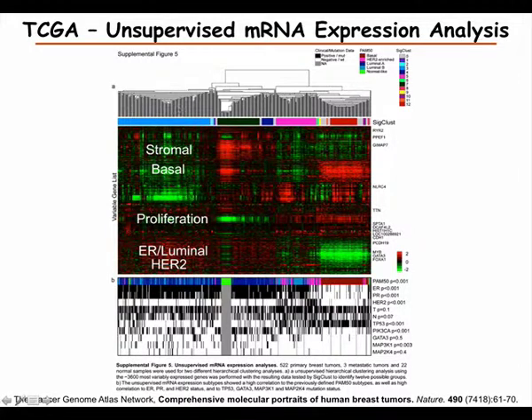So in this case, we have the samples here on top, and then we have the different genes, and a few of them just highlighted, but there are lots of them. And then underneath here, we have annotated it with other, like the PAM50 status, ER, PR, HER2, and so on. So this can often be used to summarize a lot of information.